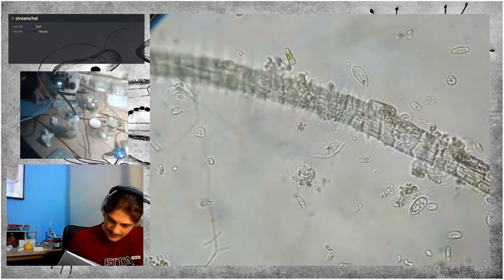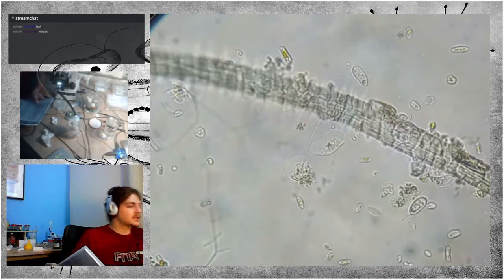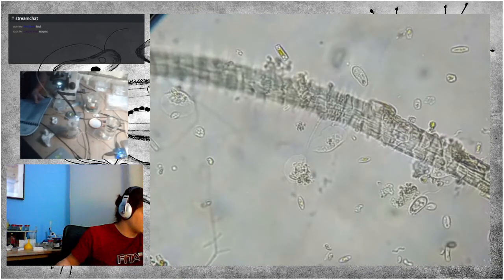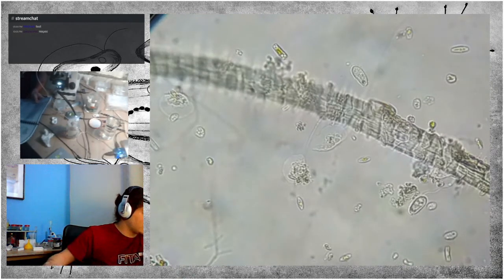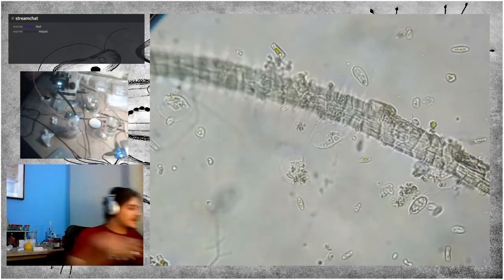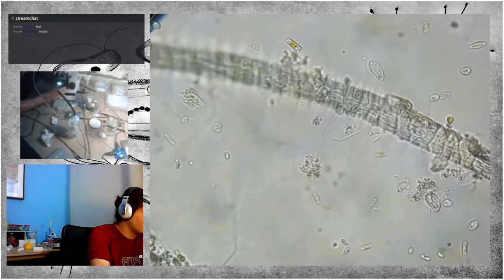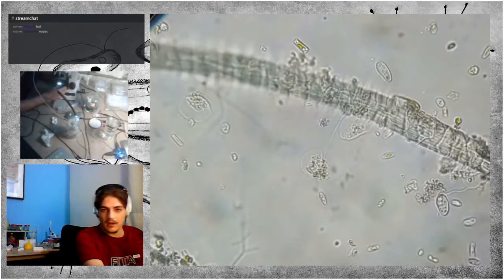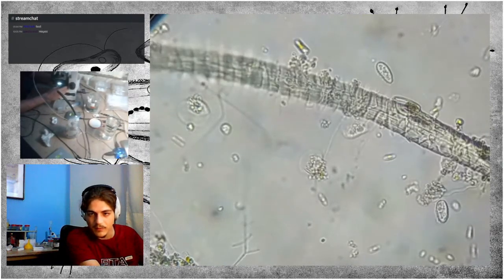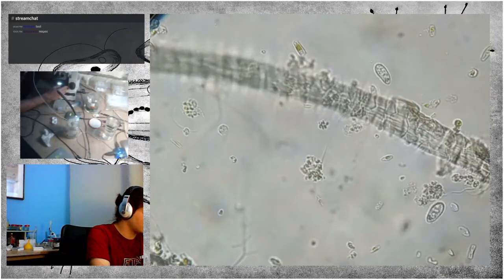I'm leaning, I'm not sure. It's probably some species related to them. There are several of them. I can see at least 3. Let me see if I can show them to you. The amoeba has moved, as you can see, it is going right under the hair.